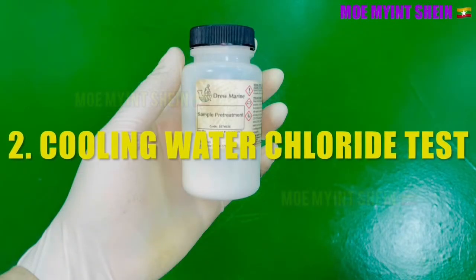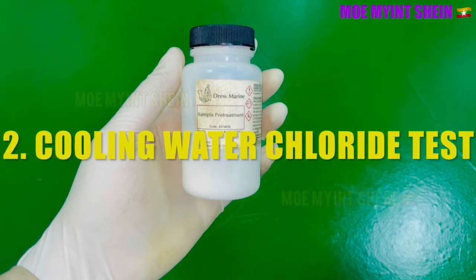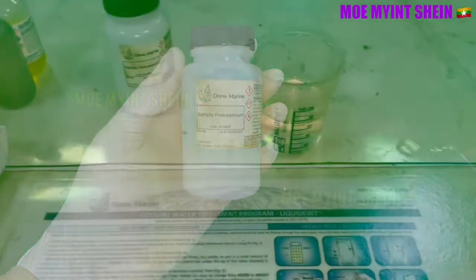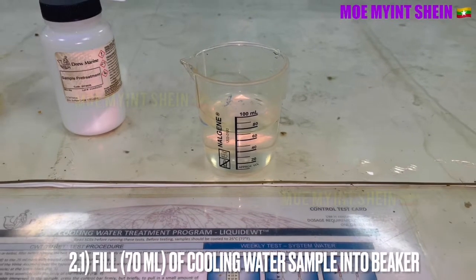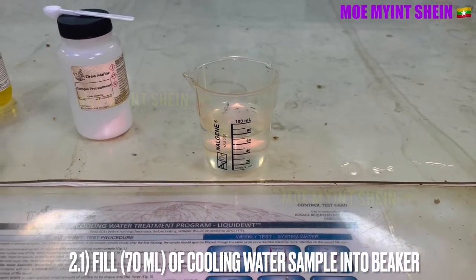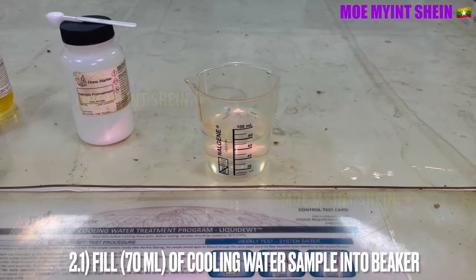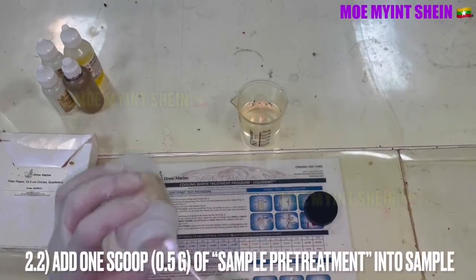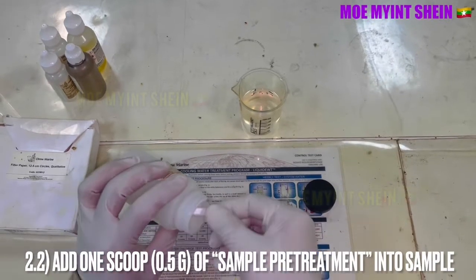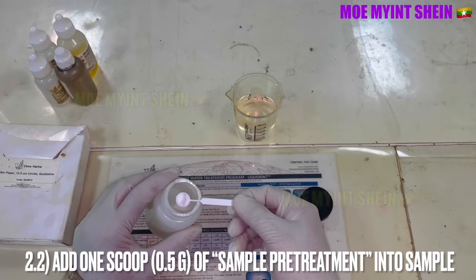Now we will test the cooling water chloride level. Fill 70 milliliters of cooling water sample into a beaker. Add one scoop, about 0.5 gram, of sample pretreatment into the sample.